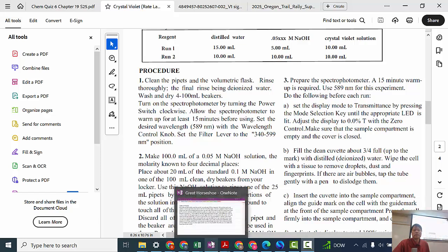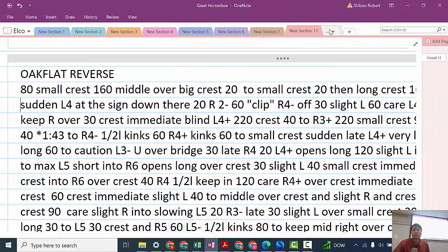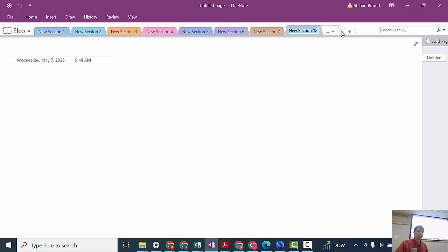Talking about a couple of other things here. Let me see. So we're going to leave the kinetics lab for a moment, and then we're going to take a look at our crystals. Hopefully you have some crystals in there, and hopefully the solution hasn't dried out completely.